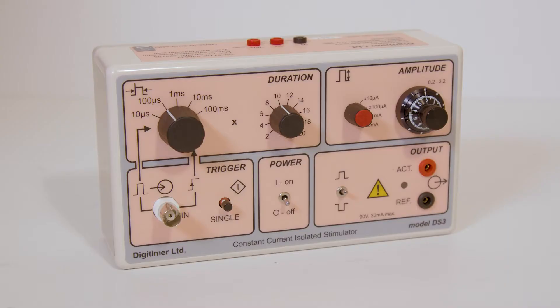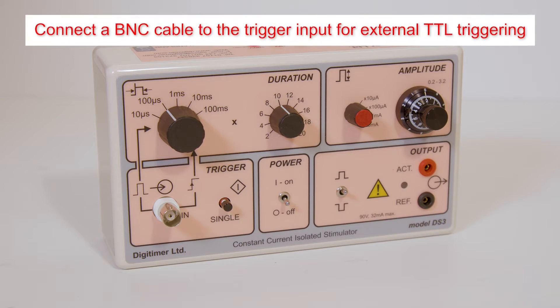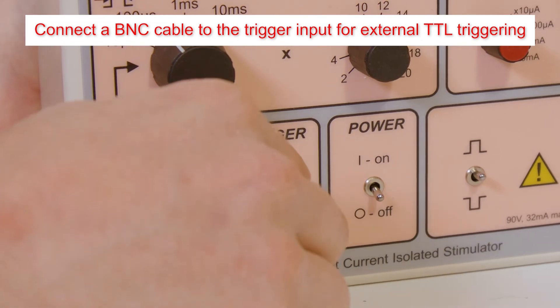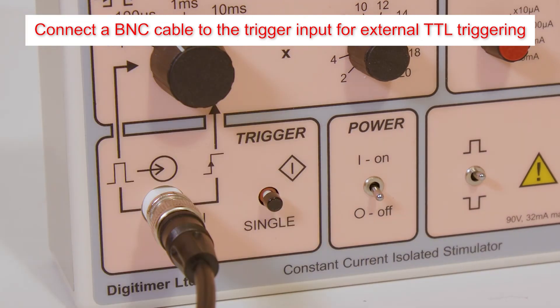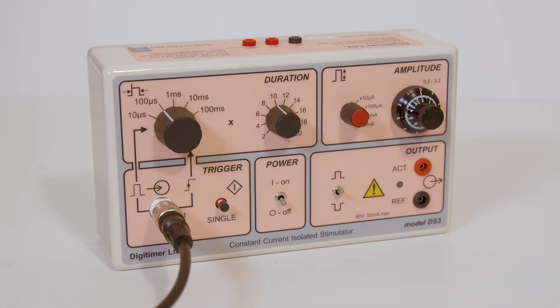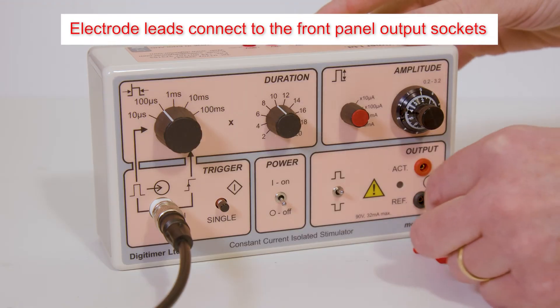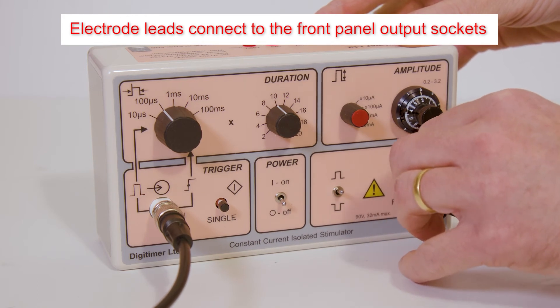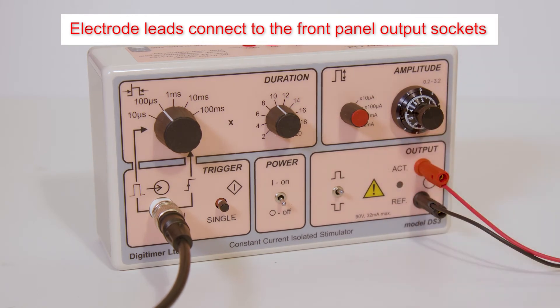The DS3 isolated constant-current stimulator can be triggered by a TTL compatible voltage pulse. To use this method of control, just connect a BNC cable between the trigger input socket and the trigger source. Digitimer provides a pair of 2 mm touch-proof plugs for electrode connection, and these should be inserted into the front panel output sockets.